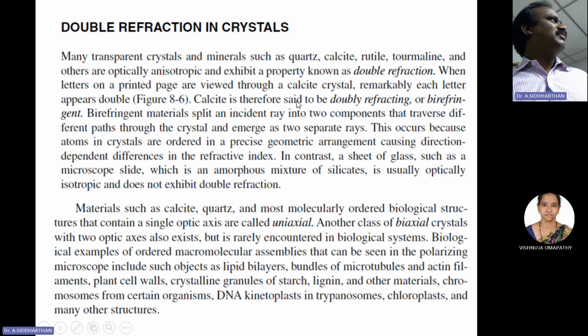Okay, what is double refraction? When we say double refraction, the materials are birefringent materials. Birefringent materials split an incident ray into two components, and those traverse different paths through the crystal and emerge as two separate waves.